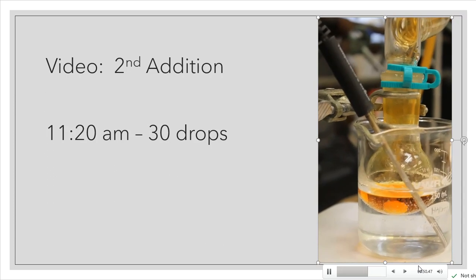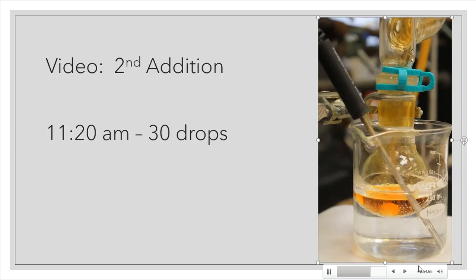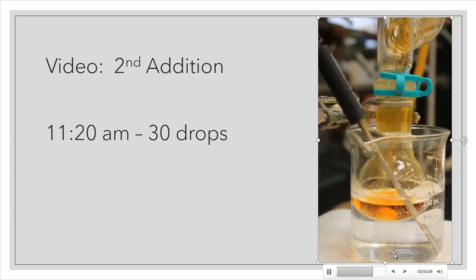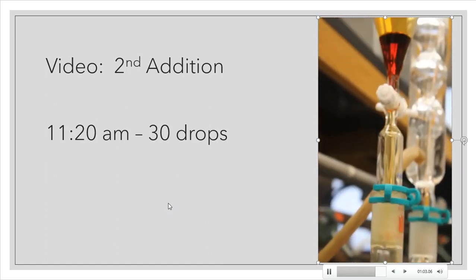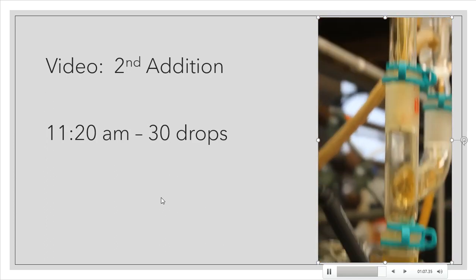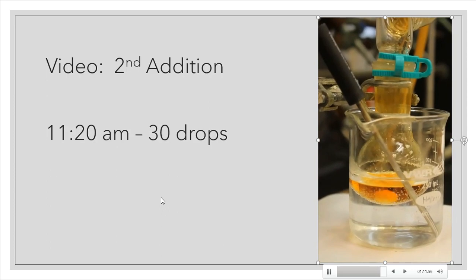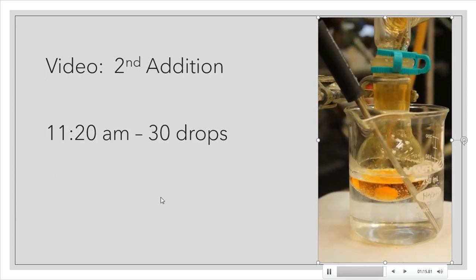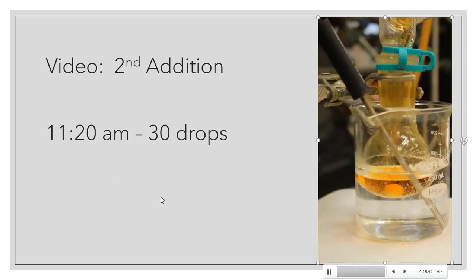So if you go back and rewatch the beginning of this video, you will probably see that this began a much darker orange than where we're ending up with now. If I compare that to what's up above, which is the bromine in the separatory funnel, you can see how dark that color is compared to this one at this point. All right, so I'm going to continue to add these small portions. I'll keep adding one portion after another until we figure out what happens at the end.